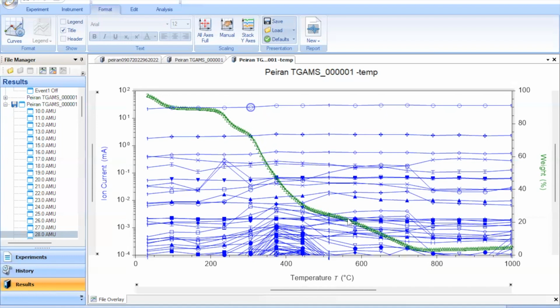Lastly, the last 2 peaks will have carbon dioxide. And so carbon dioxide has AMU of about 44. And so we expect to see peaks at around 44. Okay, so if you can see the circled points increases, they keep increasing as we go from the second mass loss event to the third mass loss event.